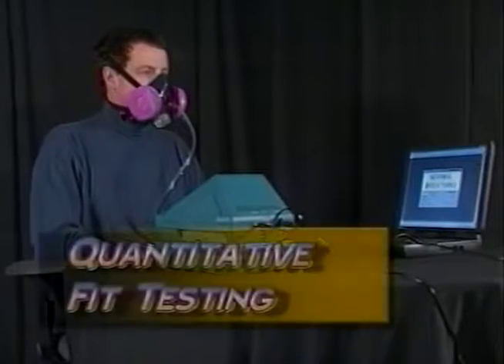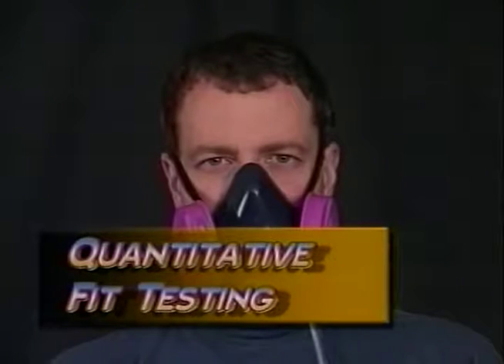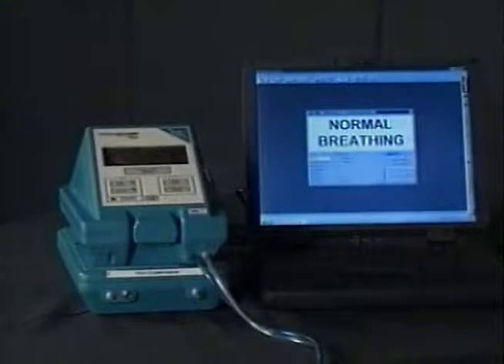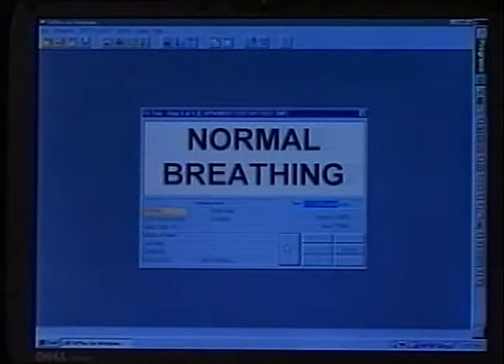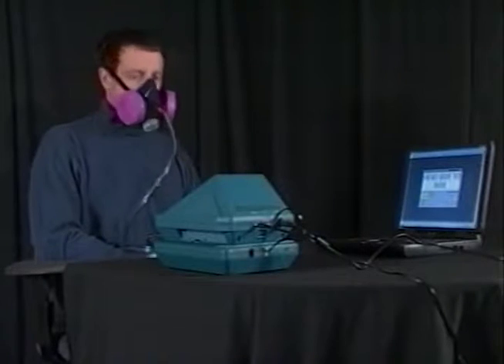Quantitative fit testing is performed by numerically measuring the amount of leakage of a test agent into the respirator and comparing the concentration inside the respirator to the concentration outside the respirator. During the quantitative fit test, the employee performs a series of exercises designed to simulate work movements. Appropriate instrumentation is necessary to quantify the respirator fit.